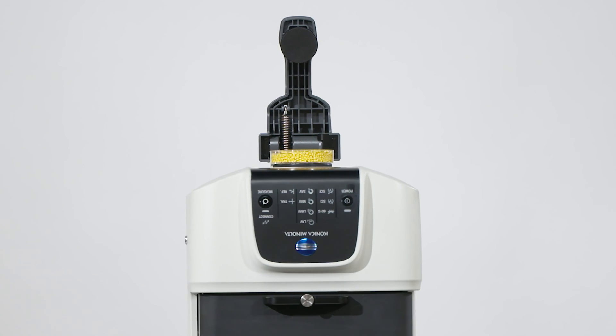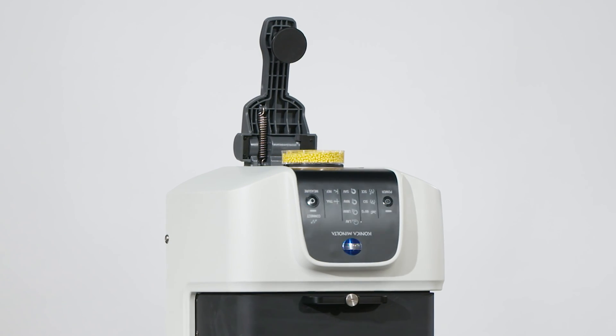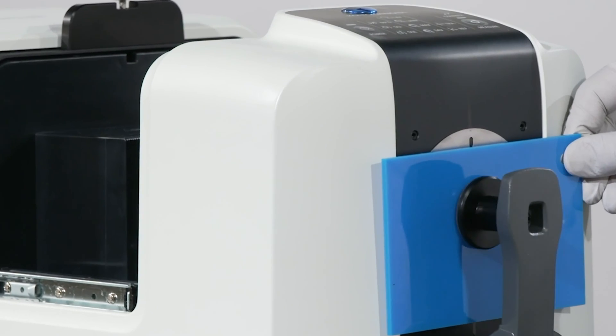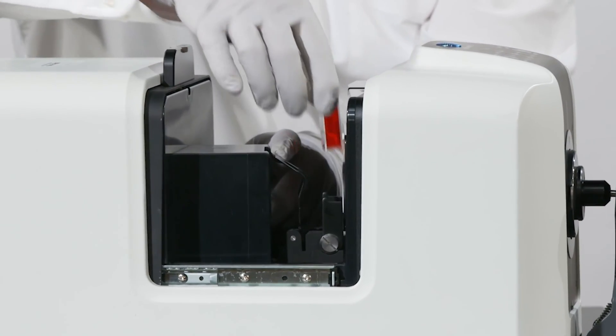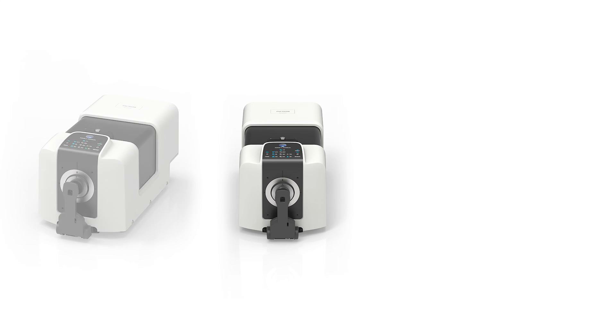Konica Minolta Sensing's patented technologies assure the highest accuracy and repeatability levels for this class of instrument while offering high inter-instrument agreement, enhanced accuracy, and maintaining correlation with older models.